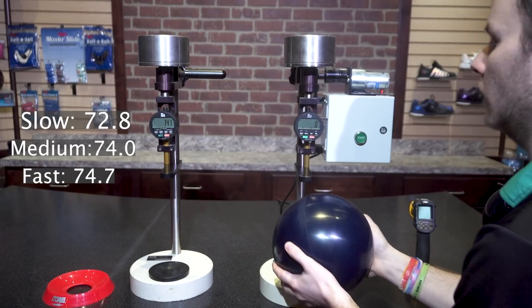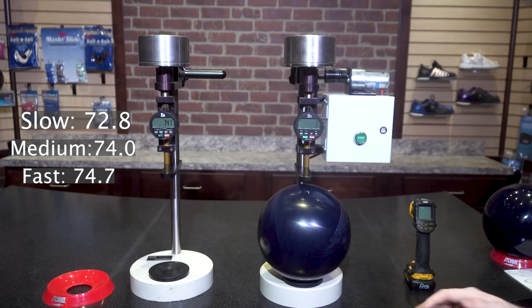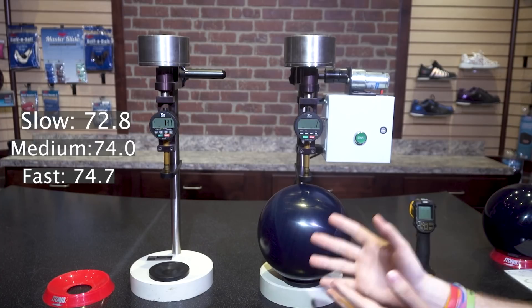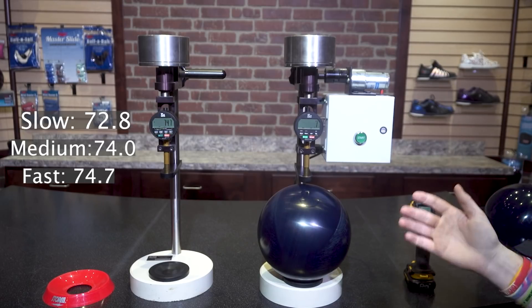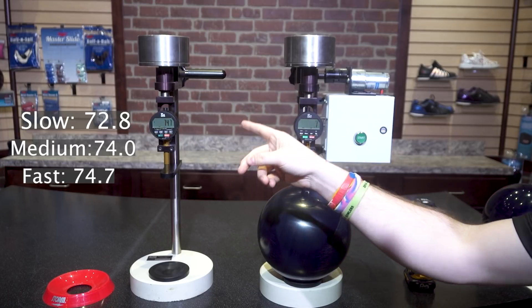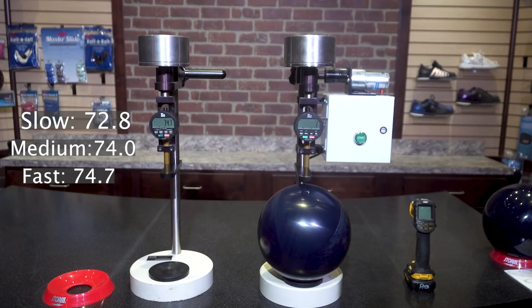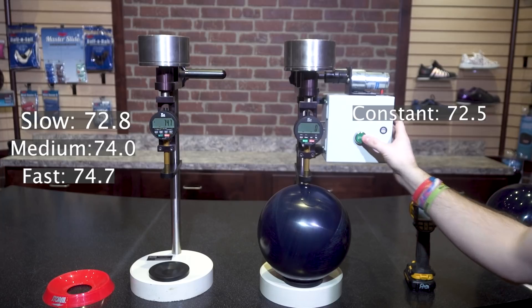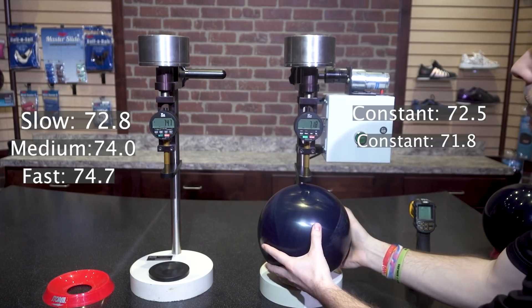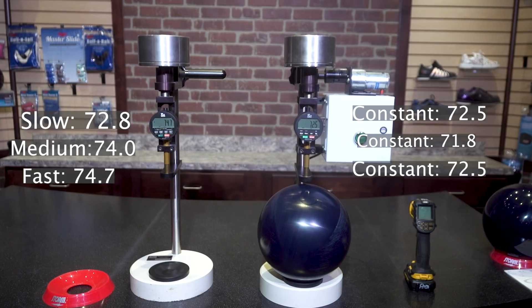Here at Storm, we created a device that plunges the needle at a constant speed, eliminating all human error. By simply pushing a button, it doesn't matter who's pushing it — the human error is taken out of the equation. From the first test, this durometer read about a point and a half softer overall, and we saw a two-point variance from different pull speeds by hand. Taking three measurements with our mechanical device: 72.5, 71.8 — that's only 0.7 difference — and 72.5. Taking the human error out of the equation makes it twice as consistent as manipulating it with pull speeds.